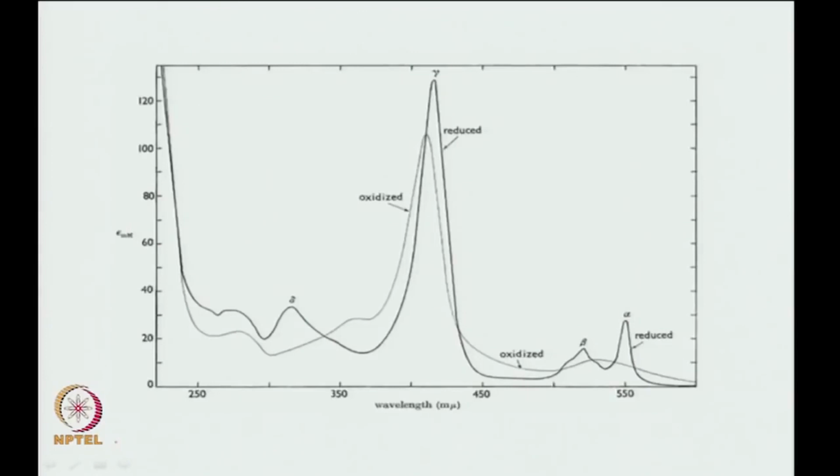And I was telling you about the absorption, right. So, this is the last slide. You can see the lasing wavelength, the pump laser, had a wavelength of 532 nanometers. Okay. Where does 532 nanometers lie? So, this is 500, so 530 would be somewhere here, or maybe somewhere there.